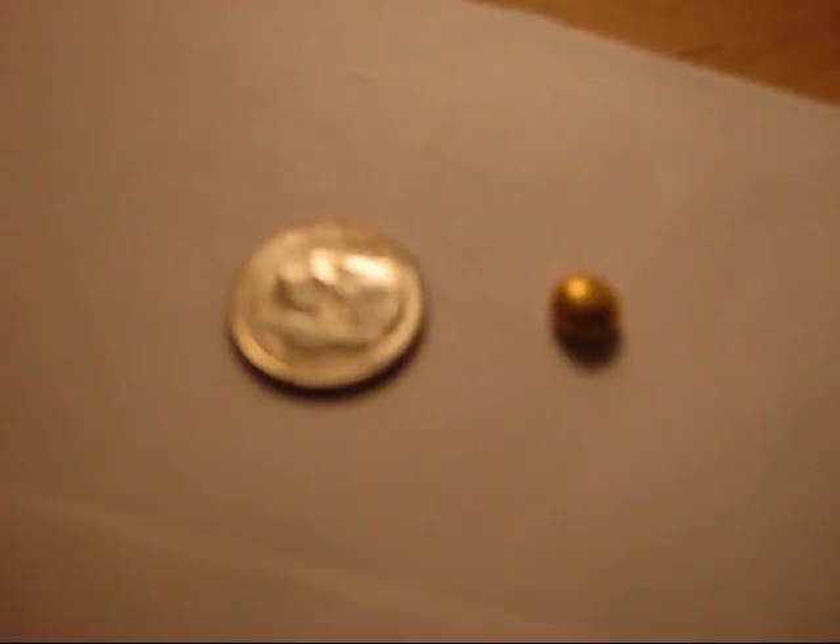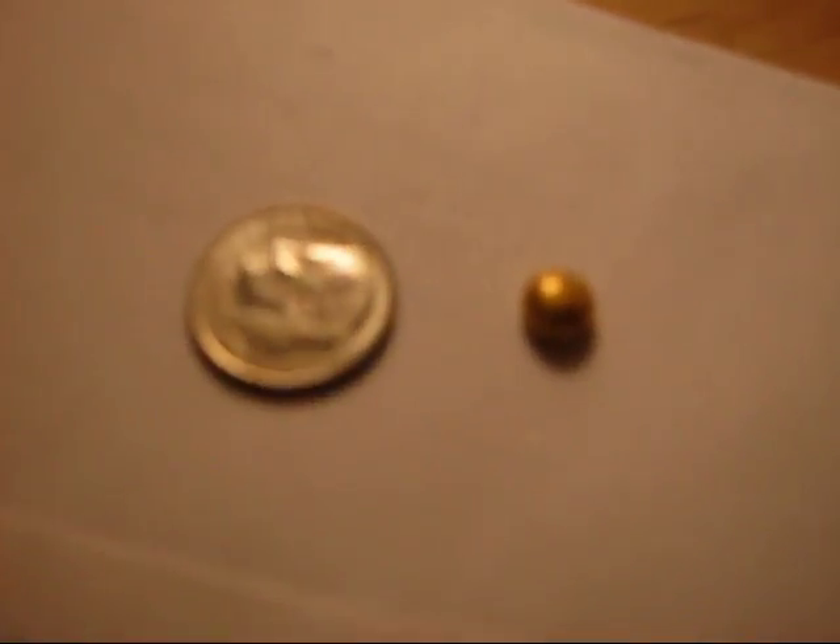That there is a gram and a half of pure gold. I'm going to put it on the scale right now so you can see. It's literally about the size of maybe a drop and a half of water. I'm going to put it next to a dime so you can see what I'm talking about — that's how small it is. On the scale it's reading 1.6 grams, though I've been weighing it for a while and it was showing 1.5 grams.